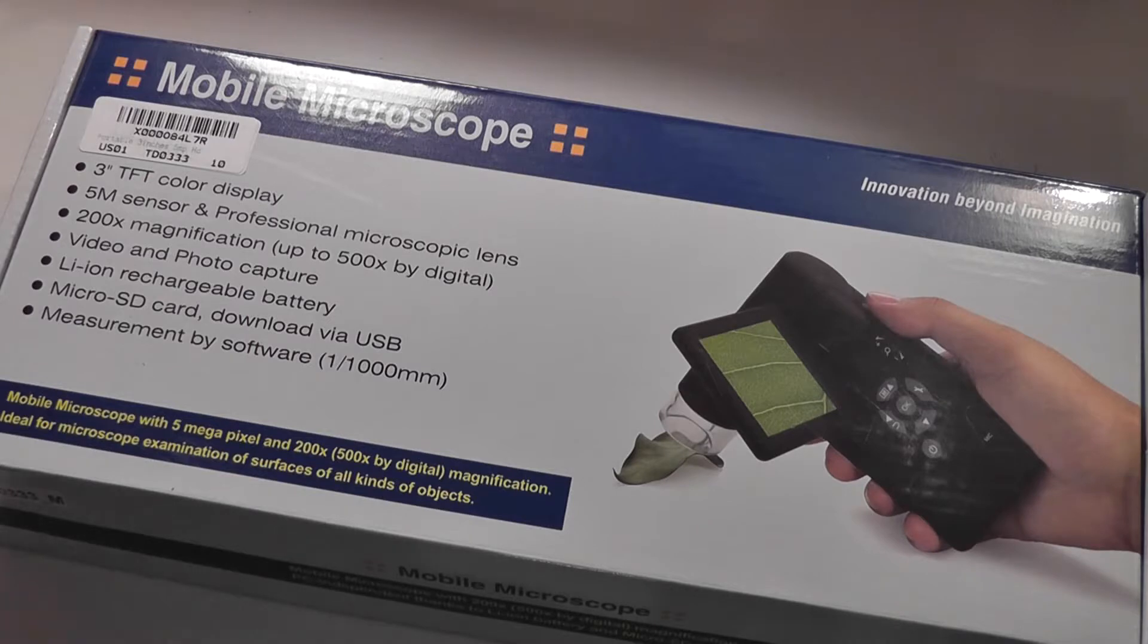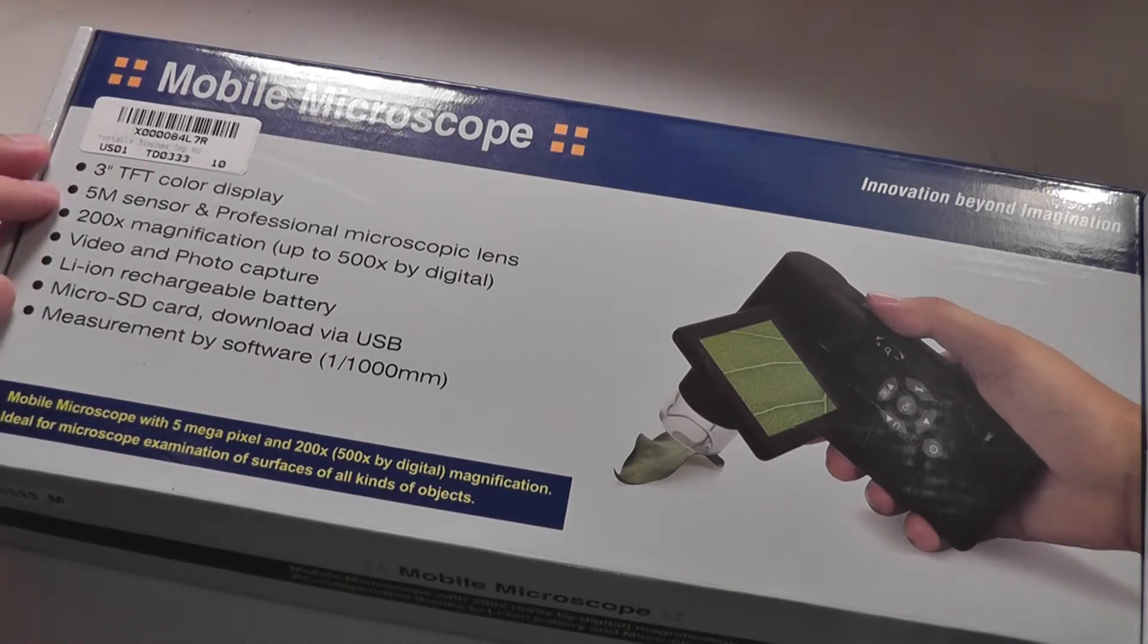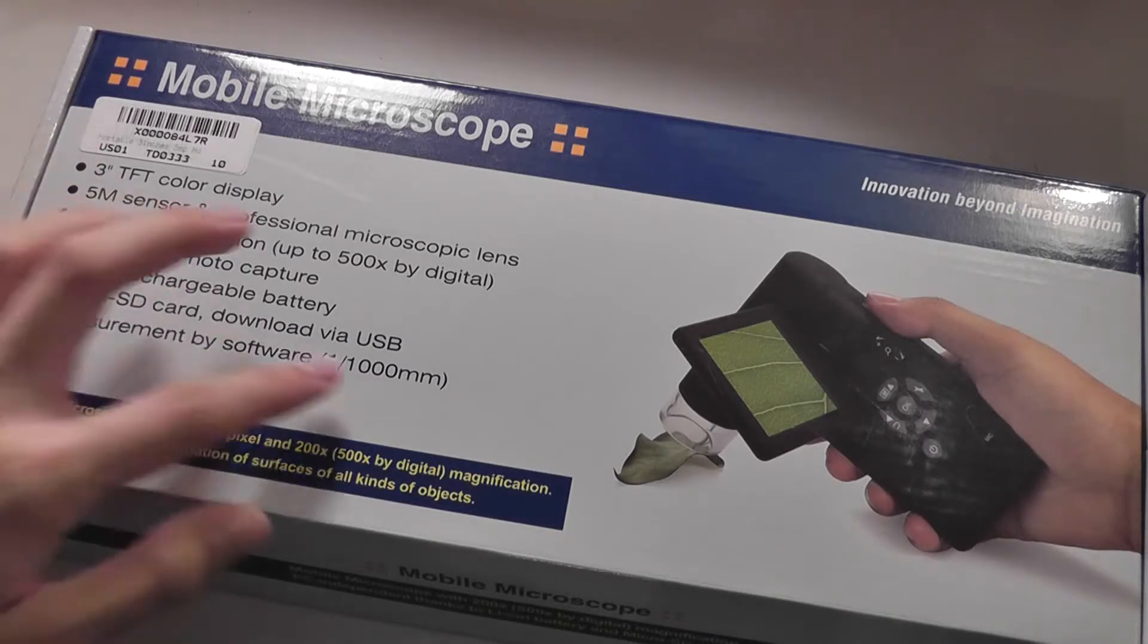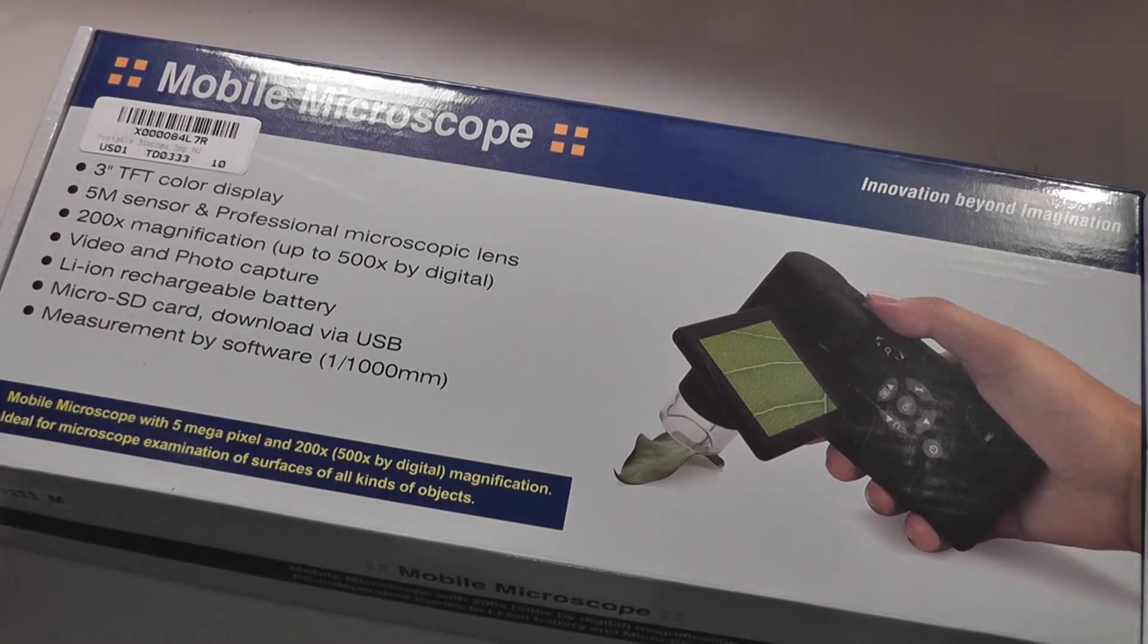Taking a look at the specifications, there's a 3-inch TFT LCD display on the front, and you have the ability to capture 12 megapixel images. The 5 megapixel here is an error. There's also up to 200 times of magnification, 500 times by digital magnification, so 200 is optical. There's also photo and video capture on board.